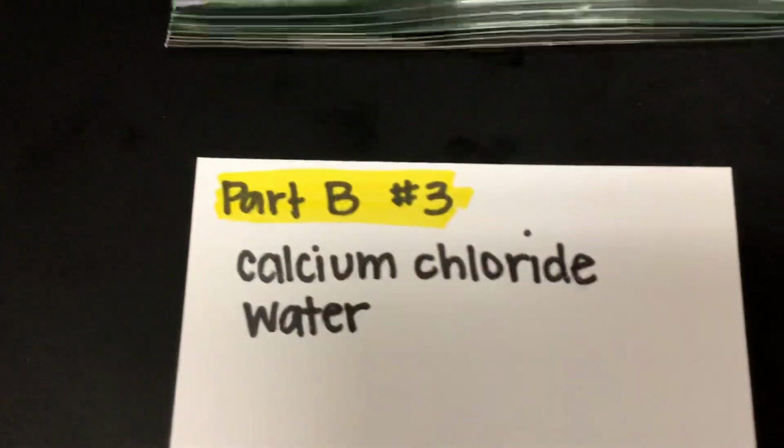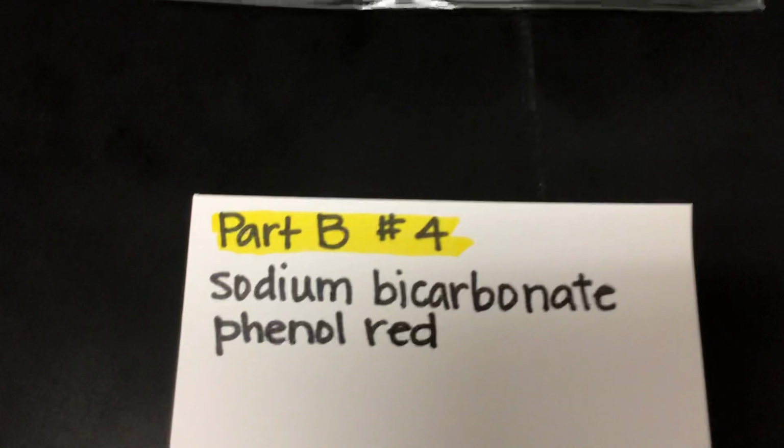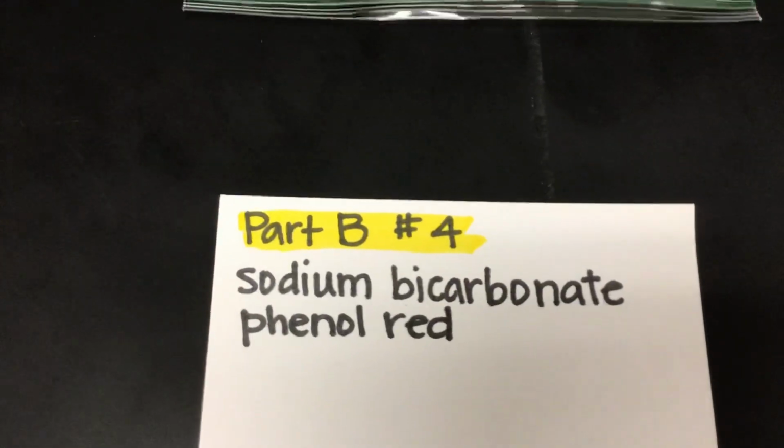All right, here is number 3, calcium chloride and water. Okay, it's also quite warm. Ouch. So it's very, very hot, she's saying. She can barely touch it. All right, so that's number 3. Number 4, sodium bicarbonate, baking soda, and phenol red.